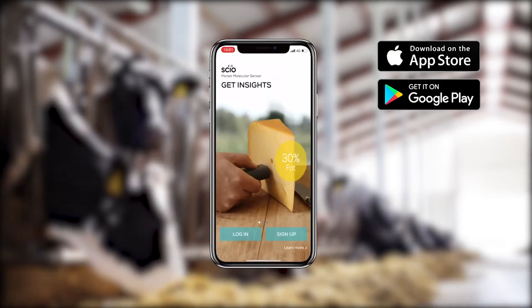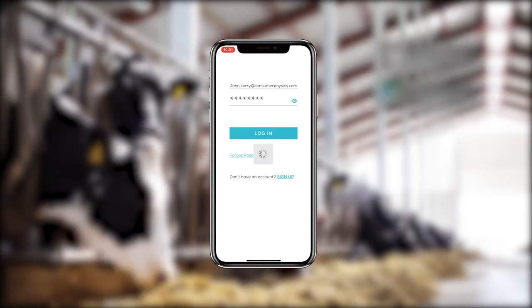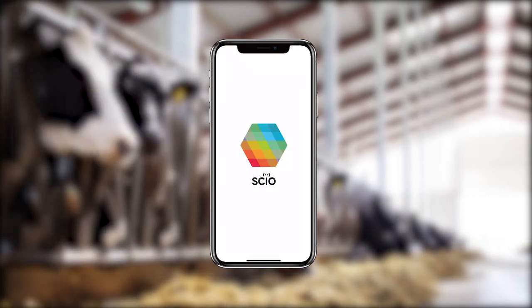Once the app is installed, sign in and pair Siocup with your phone. Simply follow the instructions in the app. You'll only have to do this once.